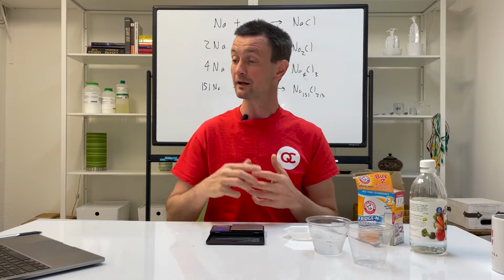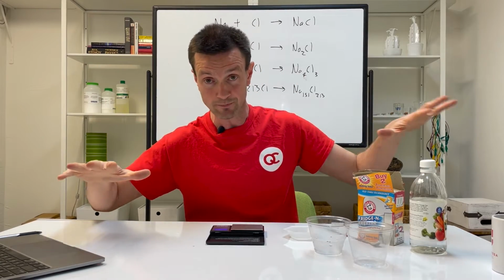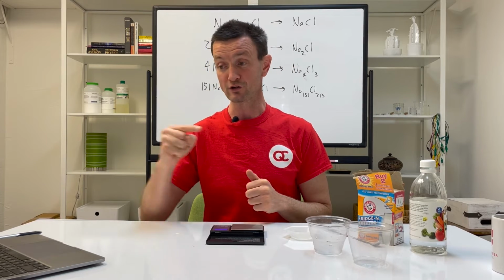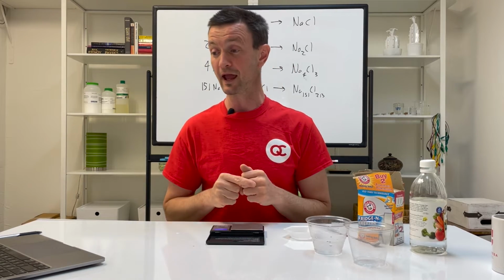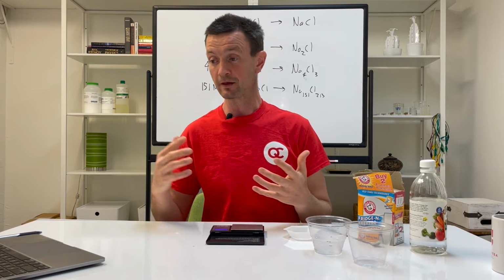So let me start. Like always, I'll just start the experiment. I won't finish it. I'll let you finish it. So I'll just set up part one for you, and then you can take it from there. So part one, lots of vinegar, 28 grams of vinegar.